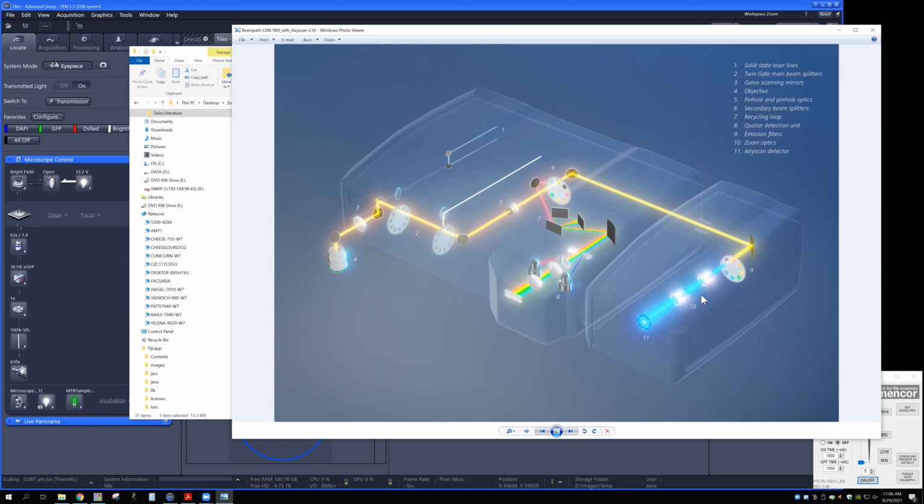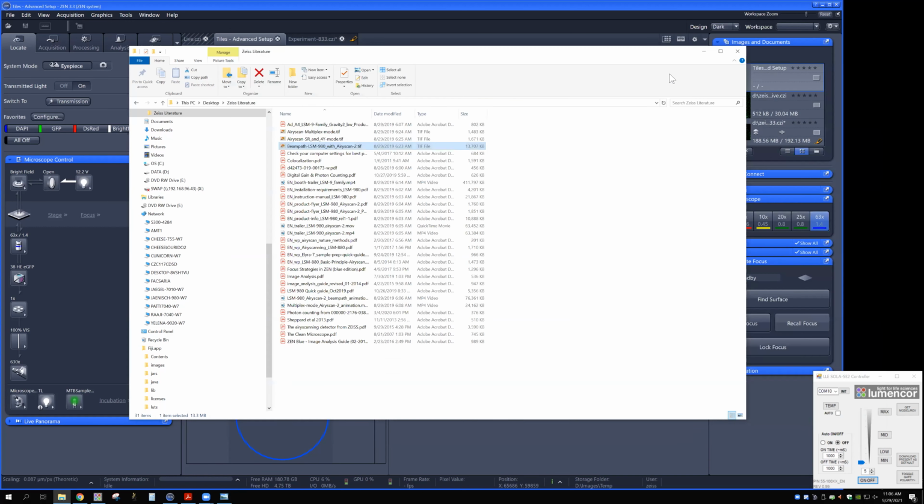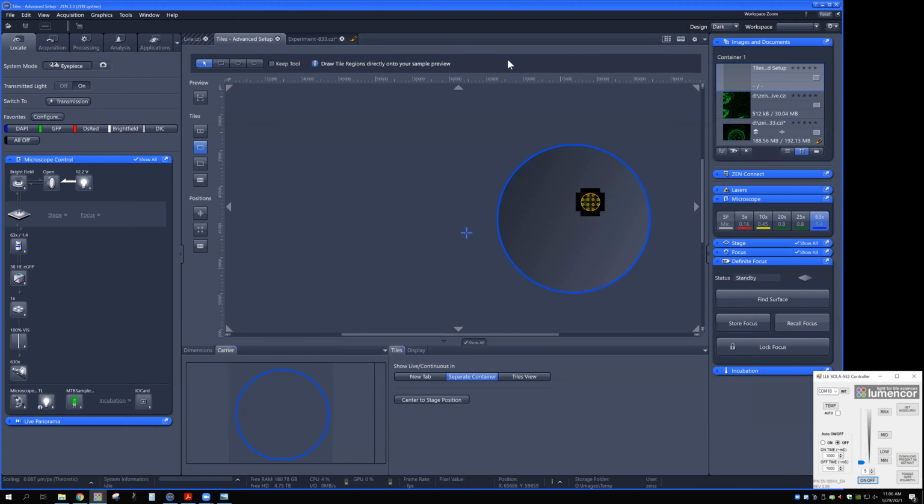These two filters in combination are what decide which wavelengths are going to reach the detector. You'll also notice there are a couple of different zoom optics and focusing optics here. We're going to do a quick calibration for these at the very start of imaging, and you'll see that as we go through this workflow. Other than that one step, and the processing we do at the end, to be perfectly honest, I find Airyscan imaging these days a little bit easier even than what we had done in the past.